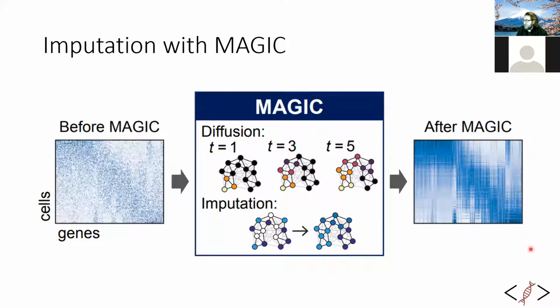And so there's actually quite a bit of criticism of this approach. I use this sparingly, and when I use it, it's only on data sets that I feel like have the depth of sequencing necessary for being able to confidently make that imputation. But there are entire dissertations written about when to apply imputation and how to apply it and what tools to use. It's not what we're going to be using here, but because it's such a popular approach, I wanted to make sure I talked about it briefly.